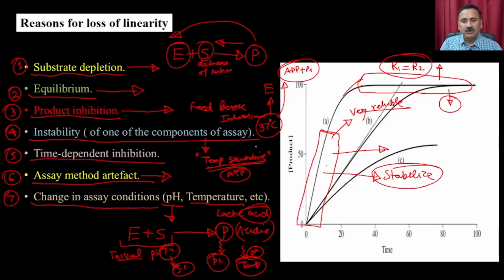It's not like it started jumping on all the substrate and then started eating them, or converting them, right? It's going to be molecular interactions, and initially the molecular interactions are going to be slow, and then it's going to catalyze. So it is not important that you measure as early as possible. You can let the enzyme get stabilized, get the reactions started, and then you can measure.